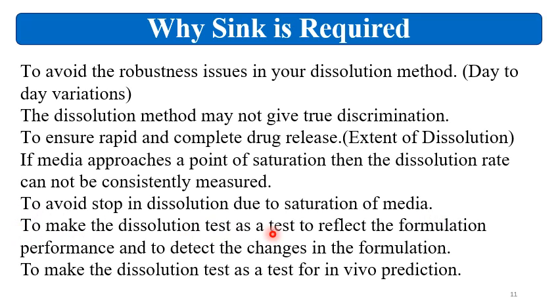To make the dissolution test a test that reflects the formulation performance and detects the changes in the formulation. That means simply the dissolution method should be robust, consistent, and it should have a discriminatory power so that the good batches and bad batches, equivalent and inequivalent batches, can be checked and reflected from the dissolution results. Then also sink conditions are required to make the dissolution test a test for in vivo prediction, that is IVIVC.